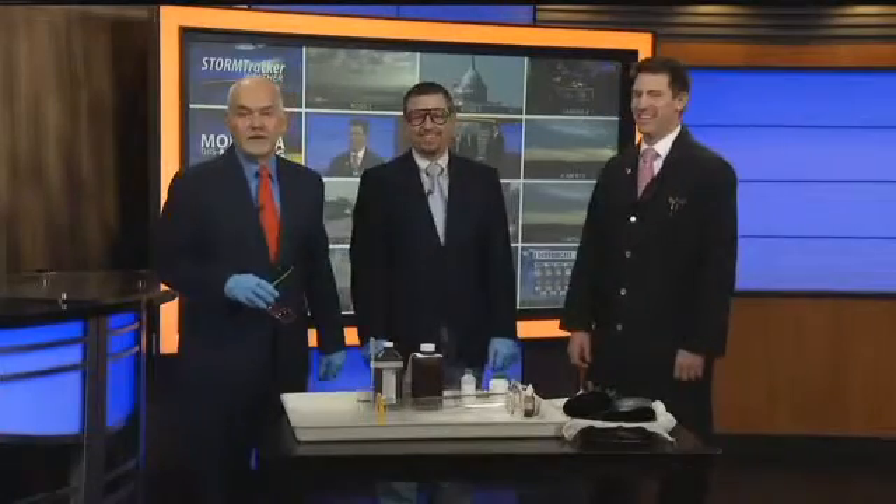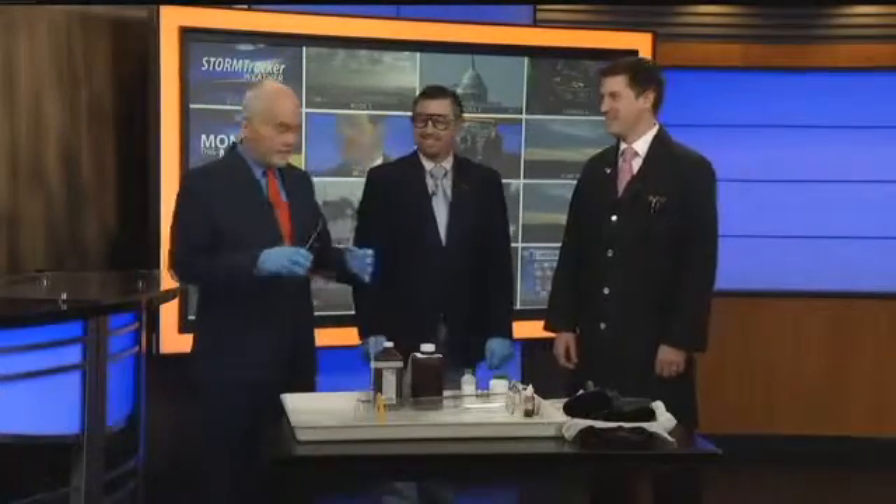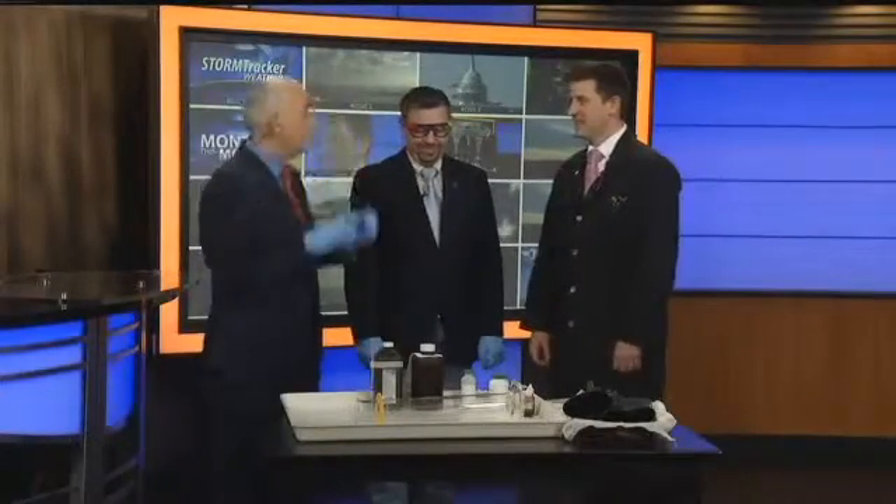I love it when we start the science spot. Craig Beals is here from Billings Senior High. We've got gloves, we've got safety goggles. What are we doing today, Craig?